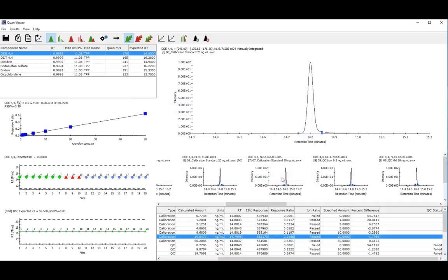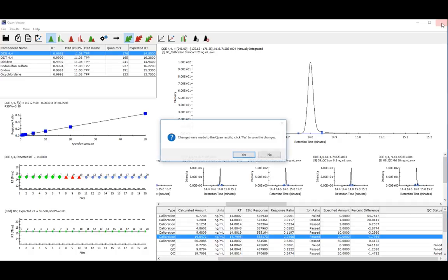If you have made changes to your data, upon exiting Analyzer Pro, you will be prompted to save these changes.